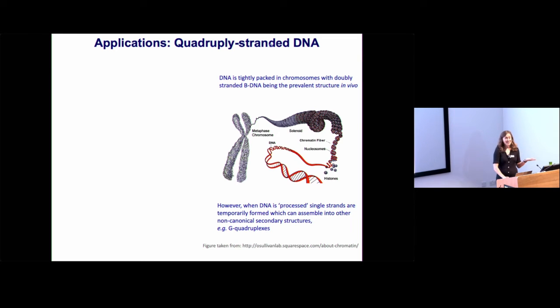Okay, so now onto DNA. So far, all the rotors that we used were freely rotating in the medium. And this is how we use their function to measure the viscosity of their surrounding environment. So this is the prerequisite, that they never bind the molecules that we want to study. However, with DNA, we now want to use the property of the molecular rotors to bind a particular DNA conformation. And it's the different structure upon binding to DNA which will tell us about the presence of different structures.